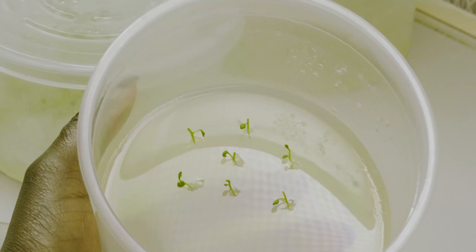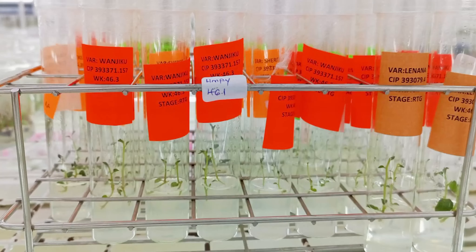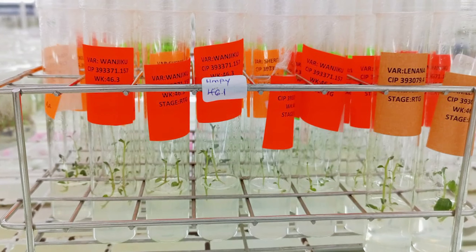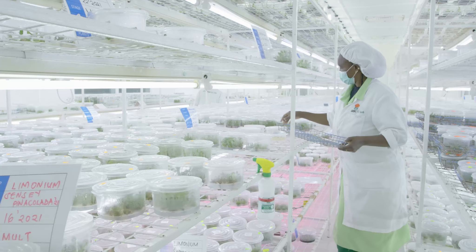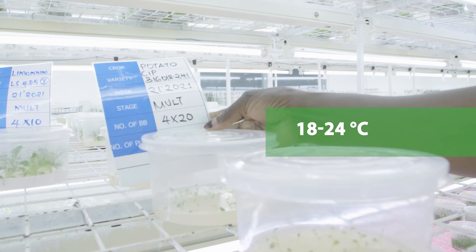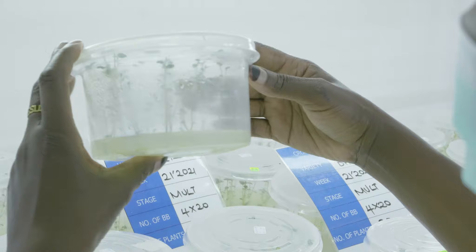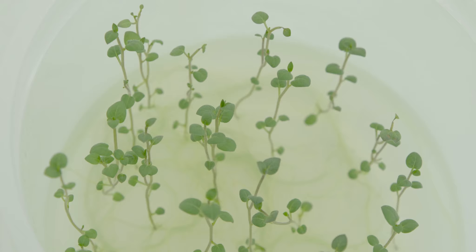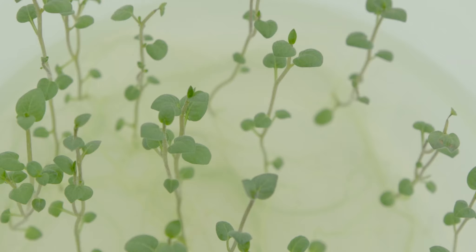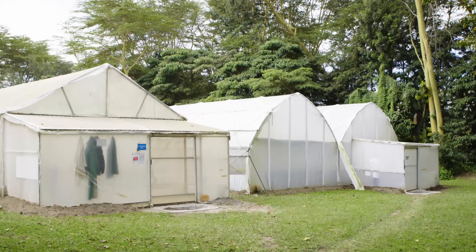In vitro plantlets are multiplied in sterile plastic containers with growth media. These containers can hold up to 20 in vitro plantlets. Test tubes are mostly used for longer period conservation of planting materials and can hold 2 to 3 in vitro plantlets. These are placed in a growth chamber with temperatures set between 18 to 24 degrees centigrade until root systems are established in roughly 3 to 4 weeks. In vitro plantlets are ready for use as mother plants when they are 6 to 8 centimeters tall and have 4 to 5 leaflets and nodes.